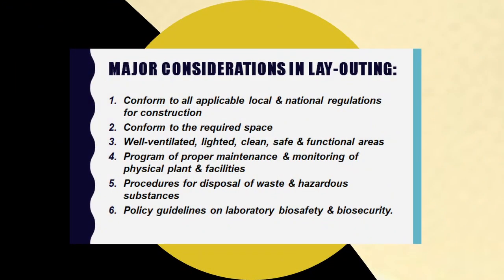Also, please take note of the major considerations in laying out the laboratory floor plan. The clinical laboratory shall conform to all applicable local and national regulations for construction, renovation, maintenance, and repair of clinical laboratory. The laboratory shall conform to the required space for the conduct of its activities.